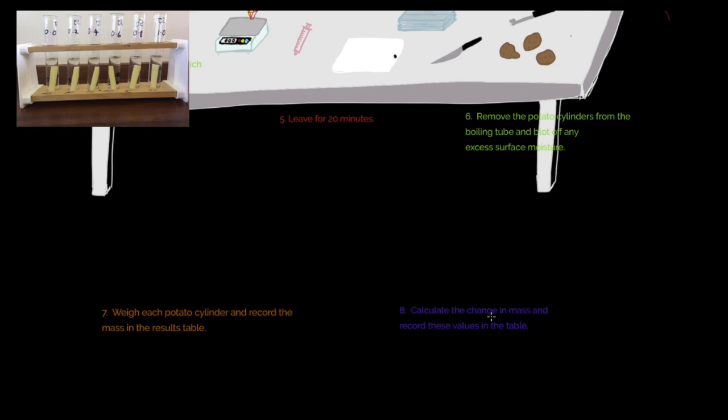And finally, we're going to calculate the change in mass. And this is a super important point. If you are calculating the change of mass, so percentage change in mass, how are we actually going to calculate that? That is equal to change in value, change in value, or if you like, change in mass, change in value over the original value, over the original value. So we're going to calculate the difference in mass, the change in value, how much it's gone up or down, and we're going to divide that by the original value. And then what we're going to do at the end of that process is we're going to multiply it by 100. And what that's going to give is it's going to give our change in mass, our percentage change in mass.